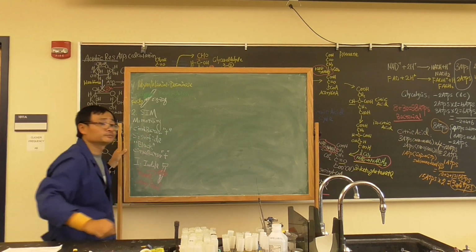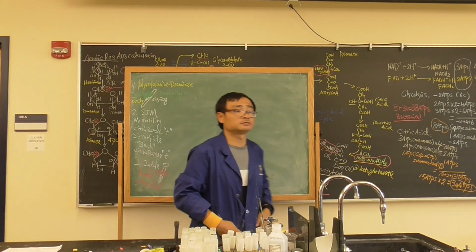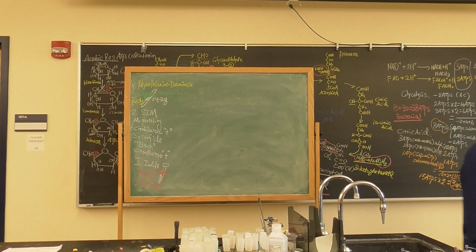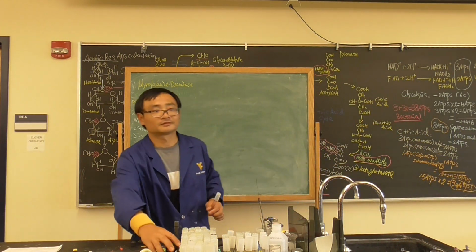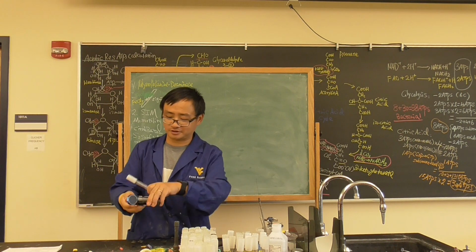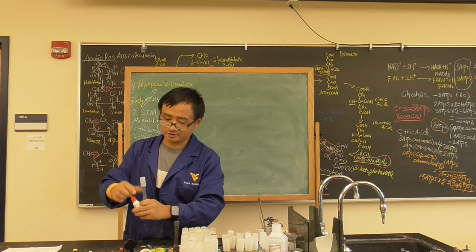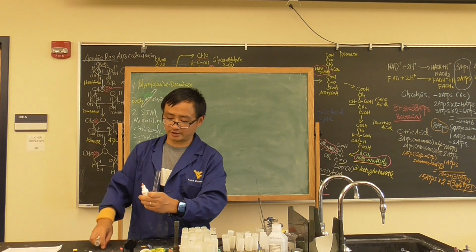Can you guys do it? Let's give an example. Who has E. coli? Give it to me. No, not this one. See? 2 points off for the final exam. You gave me the wrong tube. Kovac reagent right here. Okay, let's see what it looks like. So, we took it off. I suppose now I'm going to do this. Should I wear gloves? Okay.